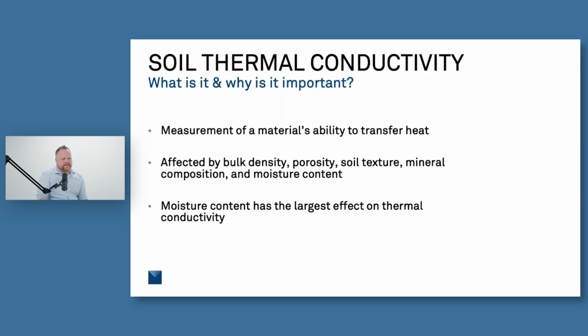I wanted to start our presentation today talking a little bit about just the basics of thermal conductivity, what it is and why it's important to us. So thermal conductivity is a measurement of a material's ability to transfer heat. It's affected by a lot of different factors, including the density of that material, the pore sizes that are present there, which also leads to soil texture. The mineral composition of the sample can also cause heat to transfer differently. Certain minerals are better at transferring heat than others, and so that will need to be taken into account.